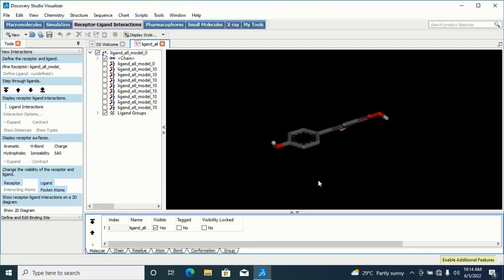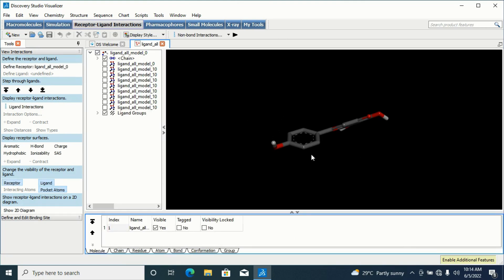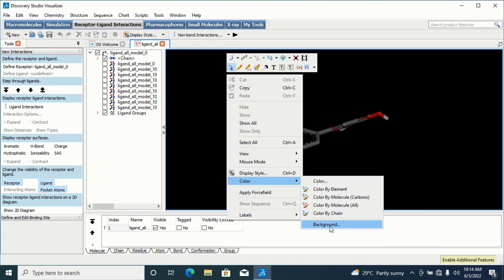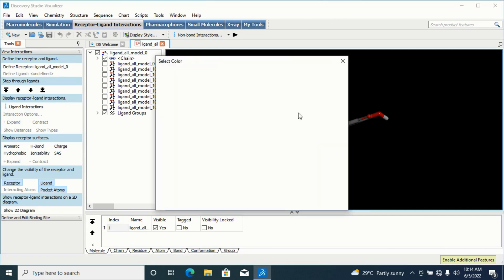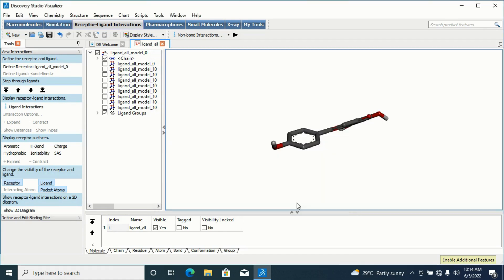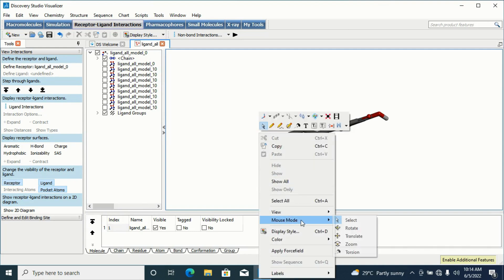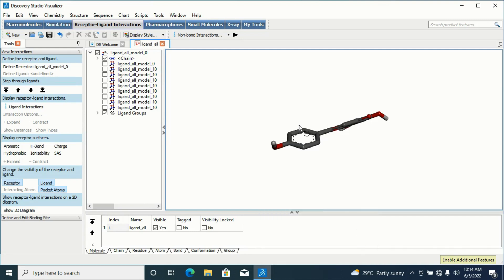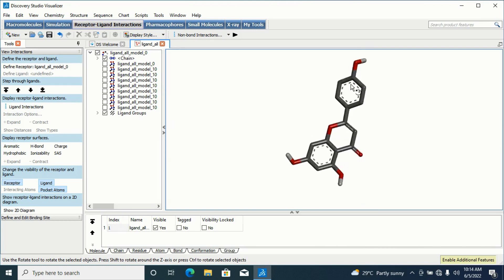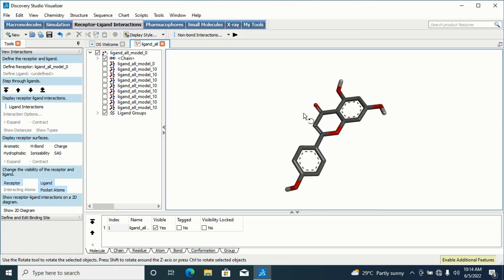My results have opened. Let me quickly change the background to white for clearer visualization. I'll change this to white, and then I'll change my mouse mode to Rotate so I can easily rotate my ligand. This is what I have.